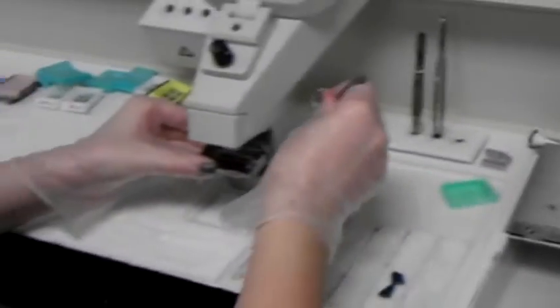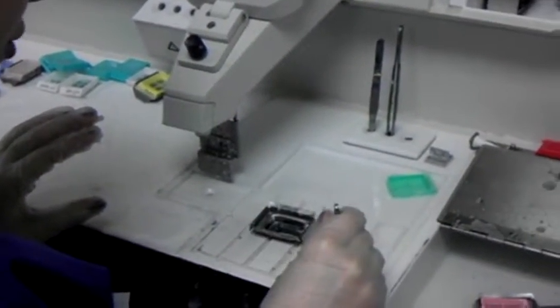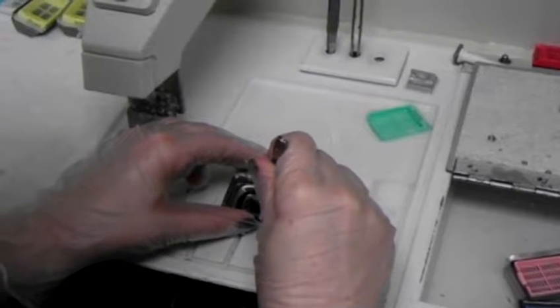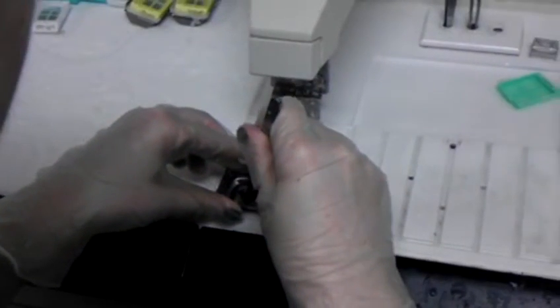Then you're going to put a little bit of wax in the mold, and you're going to arrange the tissue how you want it. Once you do, you are going to put it on the cold plate, and this will help keep the tissue down.